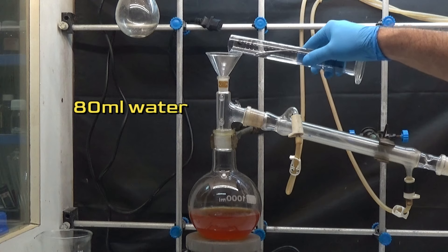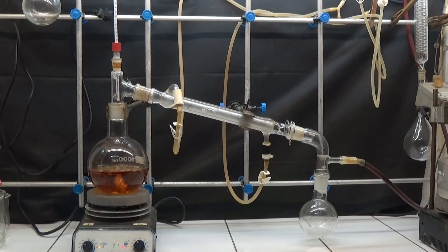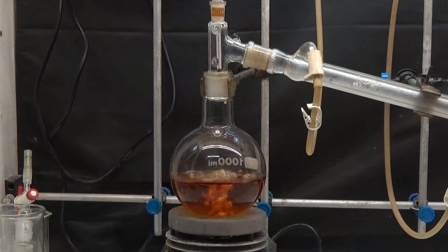After 2 hours of reflux add 80 milliliters of water. We distill under vacuum, maintaining a volume of 500 milliliters in the distillation flask.